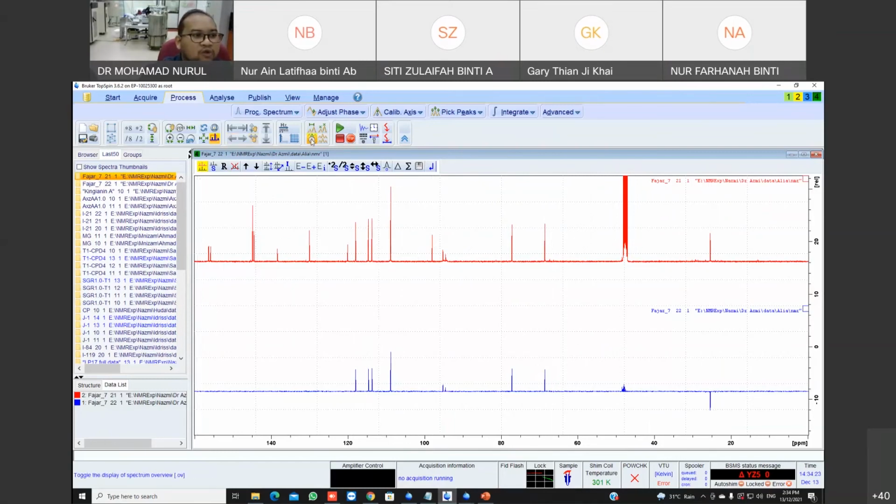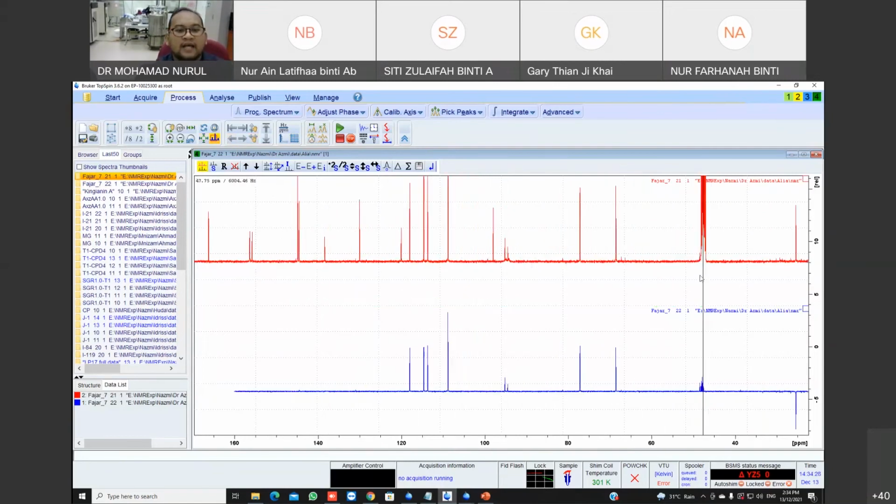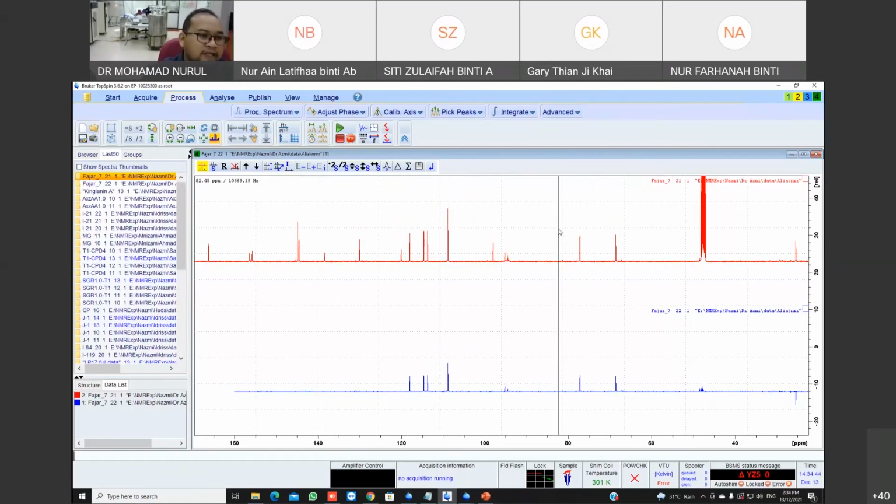Okay? To know more, I think better you discuss with your supervisor. Then you will know better, because my project and your project is quite different. I just touch until 1D NMR. For the 2D, not many people are using. But when you are using, you are free to manipulate the data that you have in future. Okay, because we want to make this session short.